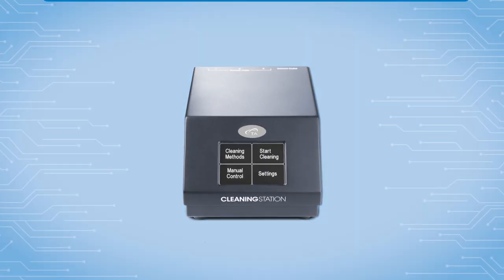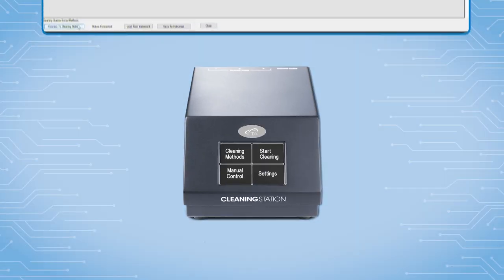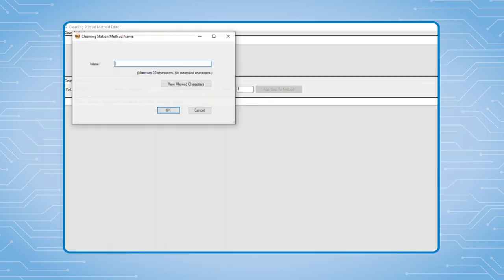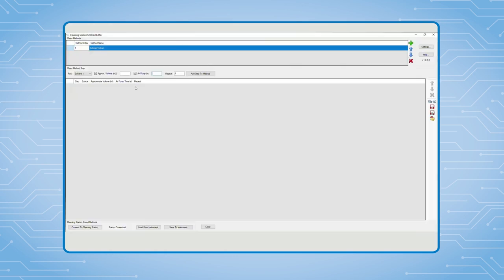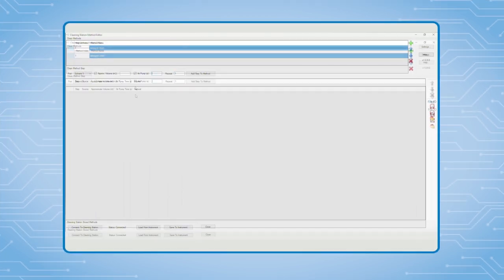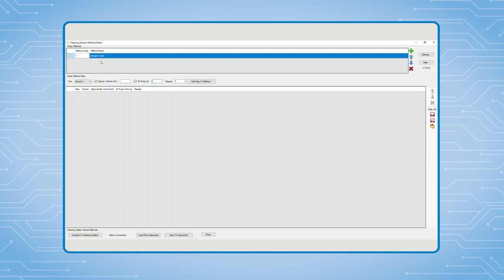The standalone software used to write, edit, and transfer methods is called Cleaning Station Editor. When writing a method, the first step is to name the cleaning procedure and then add this procedure. Multiple method names can be written and subsequently loaded onto the device. After the file has a name, the protocol is created.